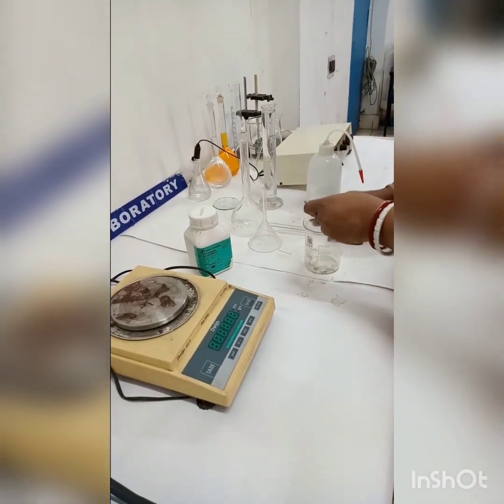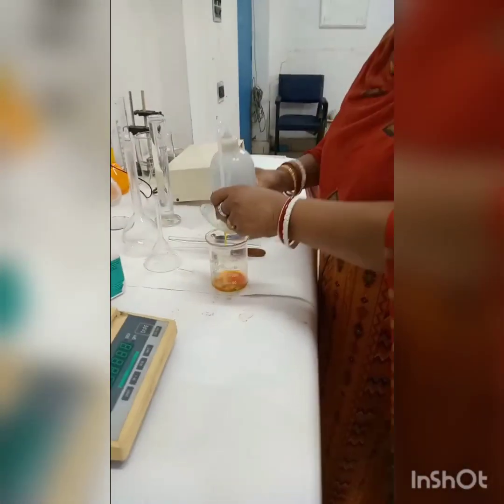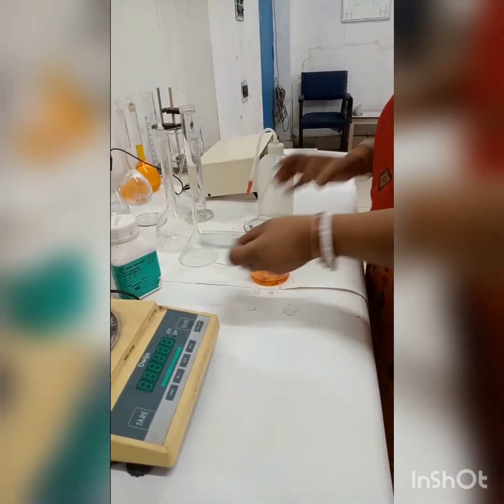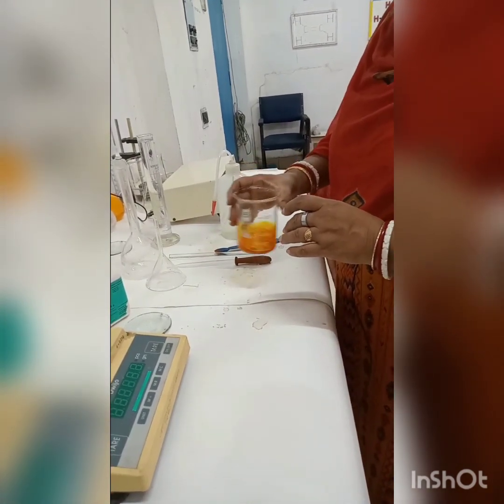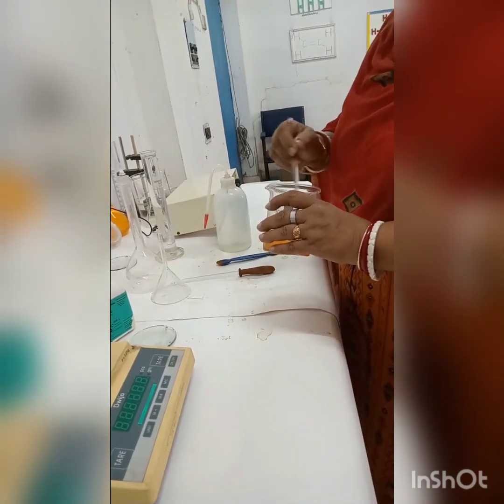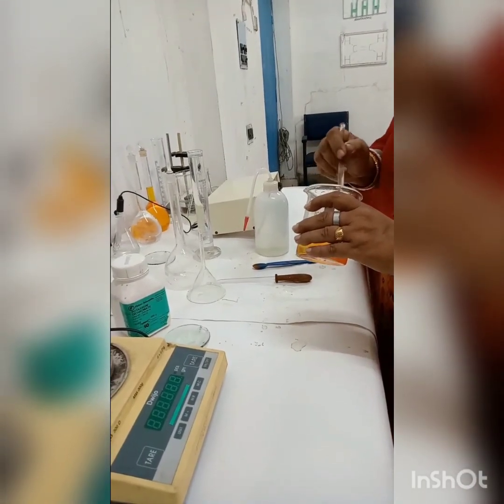Transfer it to a clean beaker. Wash the watch glass with distilled water to transfer the crystals completely. Add some water and shake the beaker. Add some more water and stir the solution. Continue stirring until the crystals are completely dissolved.